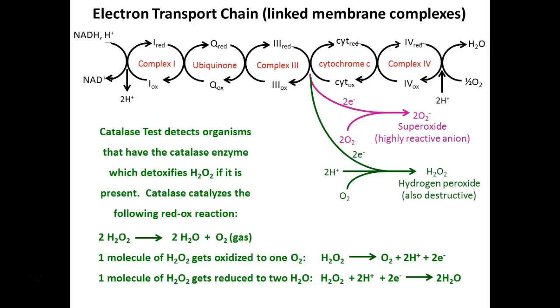No, if it doesn't bubble, it probably means your hydrogen peroxide is old and you mostly just poured water on yourself. If you were to pour it on yourself, it should always bubble. Because we're aerobes, we have catalase. Your cells should be breaking this down and it should always bubble. If it doesn't, throw it out and get some new stuff.